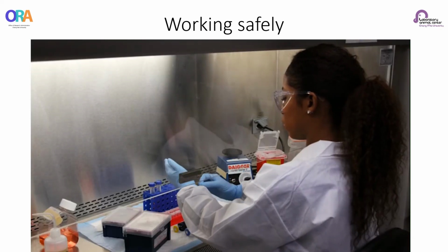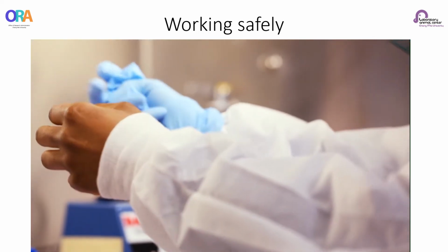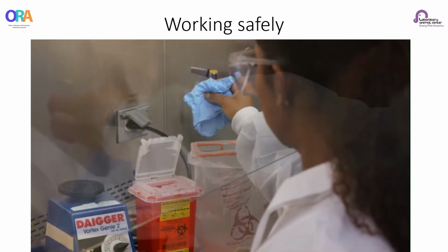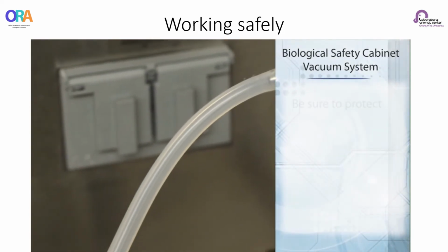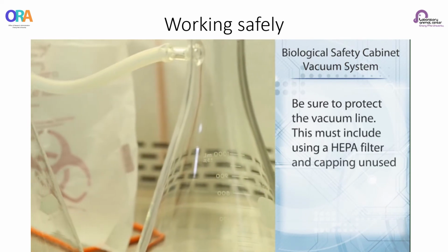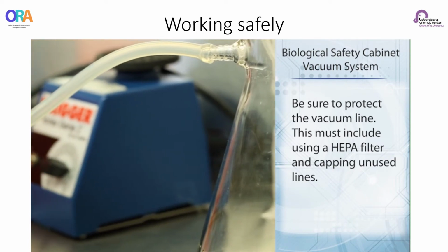Please note, some laboratory SOPs may require you to remove your contaminated gloves and place them in the biohazard container prior to exiting the BSC and put on a new pair of gloves before re-entry. Be sure to protect the vacuum line. This must include using a HEPA filter and capping unused lines.